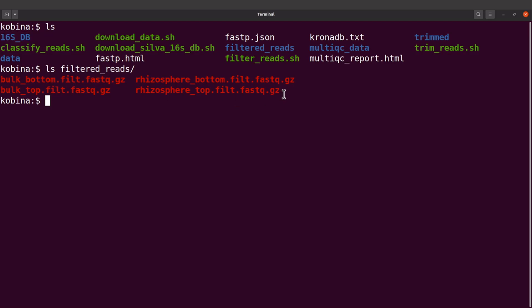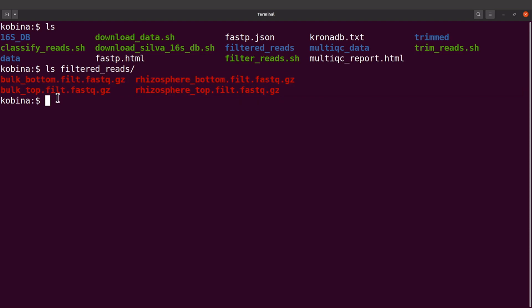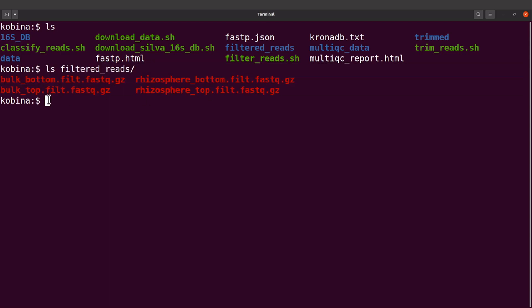Because we are dealing with more than one sample, I thought it's wise to prepare a script so that we can use that script to take each of these samples and then perform the taxonomic classification.